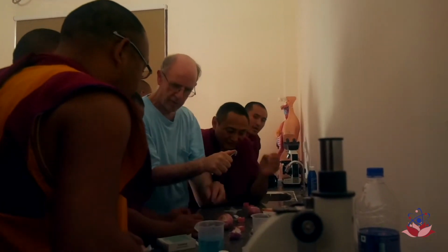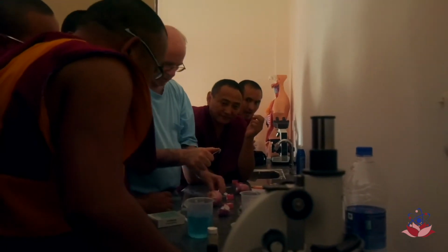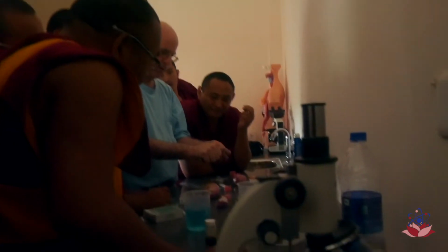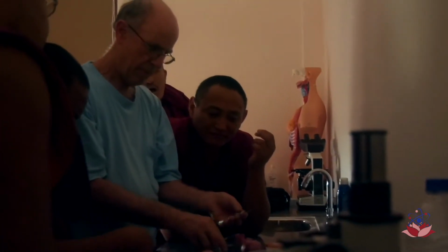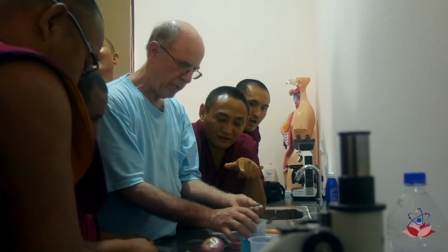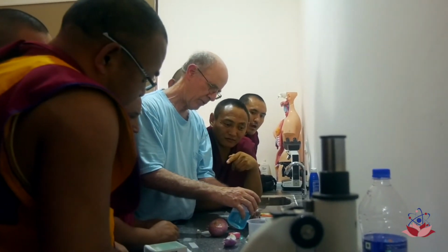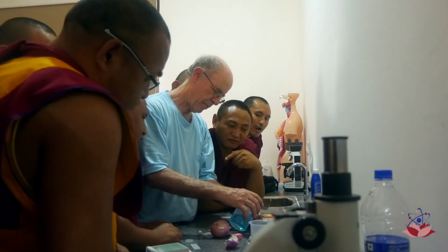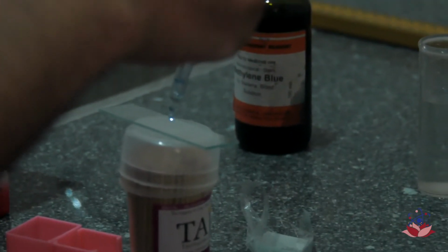You get that off, then you take one of these slides, take the paper out, lay it down. Yeah, you want a little bit of water. This is just another dial. Just to get it.